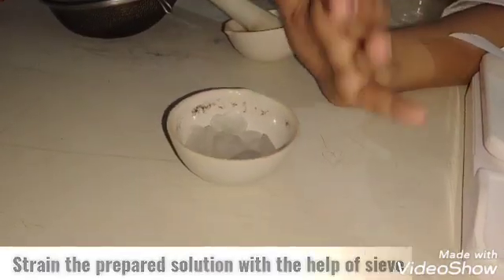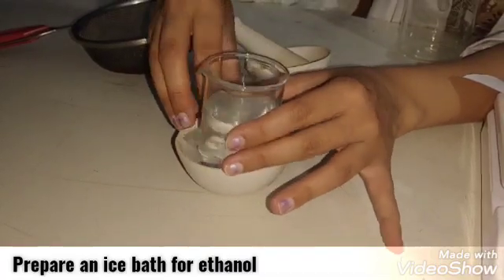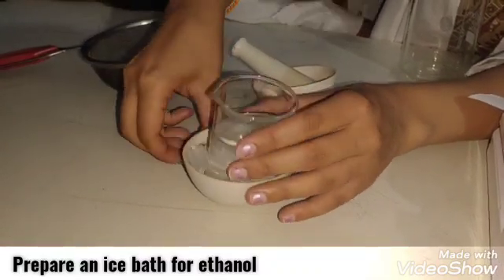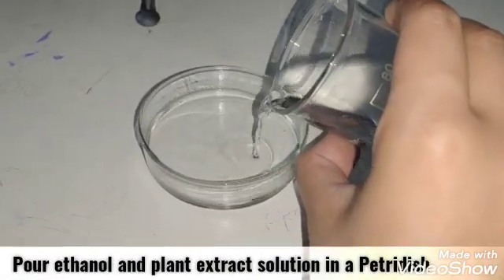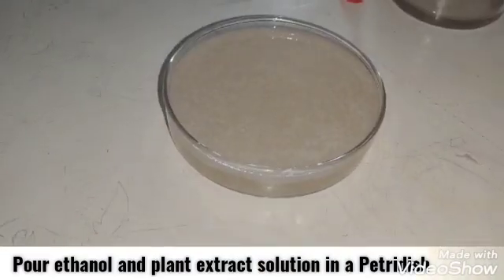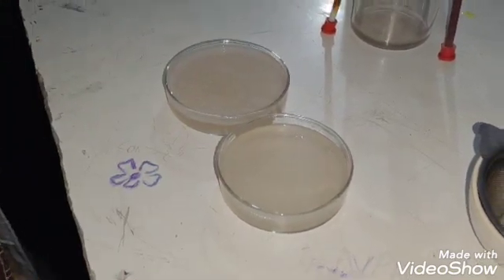Now, let's prepare our ice bath for ethanol. Take some ice cubes in a china dish and put ethanol in it for freezing. After some time, pour the ethanol into a petri dish and add the prepared plant extract solution. After some time, you will observe the DNA threads.